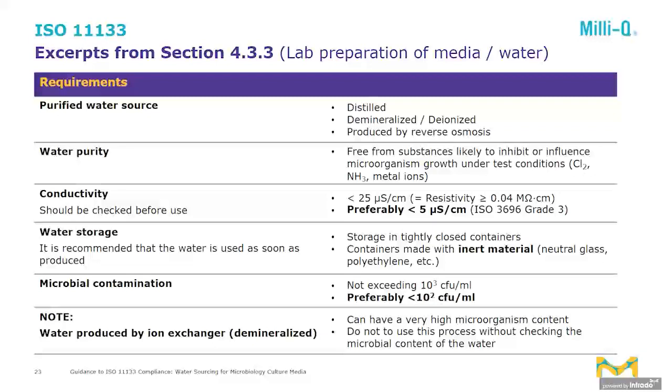And finally, there's a note in this section that's quite interesting. It says that if you choose to use water produced by an ion exchange resin, demineralized water, you have to be careful because it can have very high microorganism content. And in that case, you should not use it without first checking the microbial content of the water.